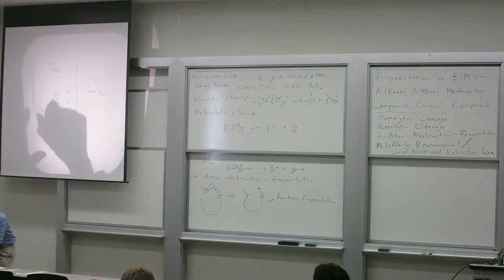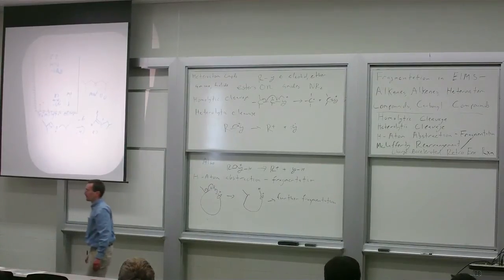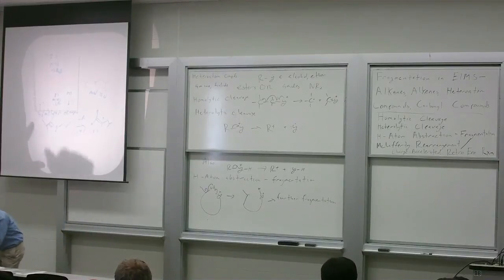All right, our heterolytic cleavage path, or our homolytic cleavage pathway, can be applied here. That gives us loss of an isopropyl group. That gives us our minus 43. This is the structure then of our peak at 87. Our heterolytic cleavage pathway gives rise to the base peak, the biggest peak in the spectrum.